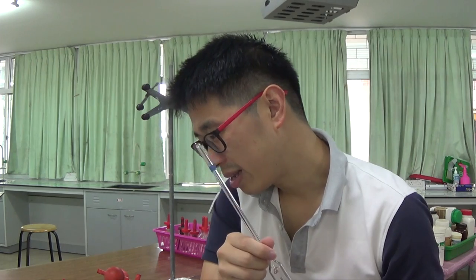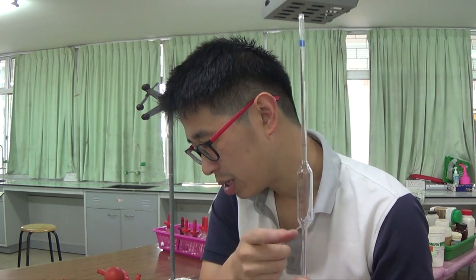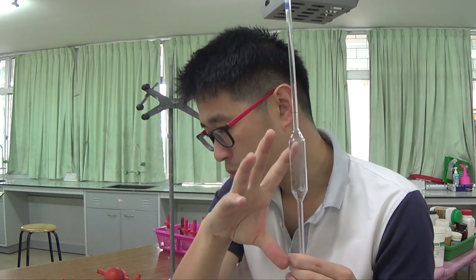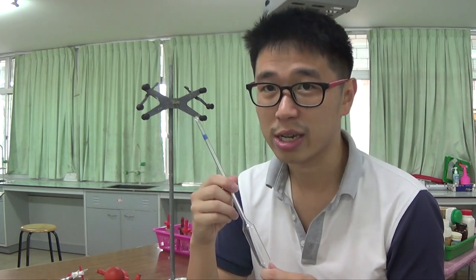Anyway, let's just be safe. I think it shouldn't matter if you wash this with water here, because the moles of whatever you put in are still the same, so it's still going to react with whatever amount of the other stuff that you have in here. This is not a usual titration with an indicator. This is what you call a calorimetric titration between an acid and a base.